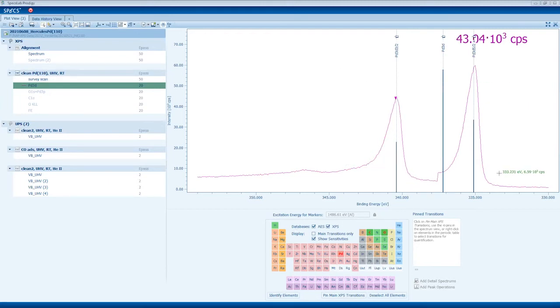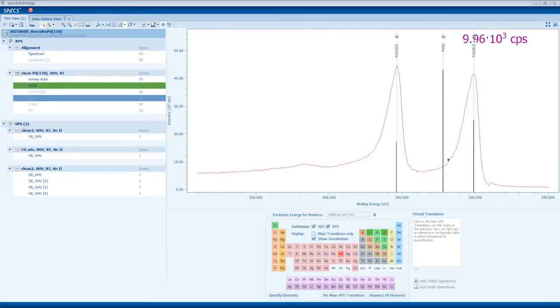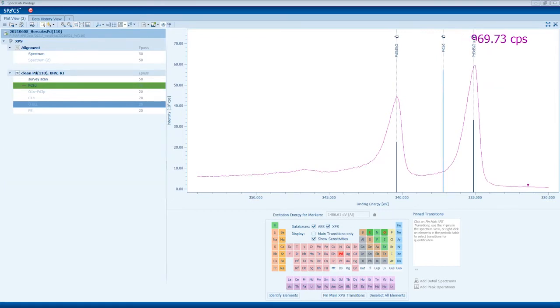Actually, PD can also allow you to see all those sweeps. It's a little bit hard work to do that, but at least you have the chance to correct the data if you have such problematic samples. So you always have to check if all the sweeps and the scans are at the same position, and have the same width.